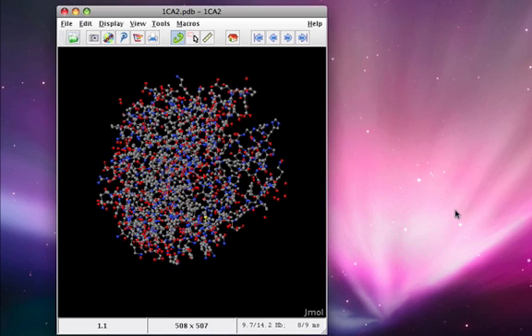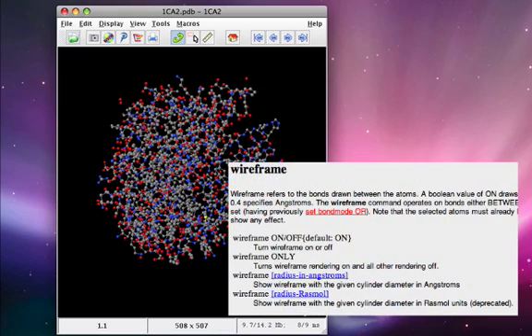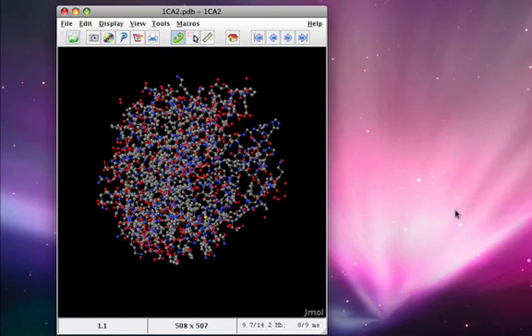Well, as you'll learn, there's a command in Jmol that strips away all of the bonds and atoms and leaves a very simple cartoon view of the protein behind. We should probably start here, and then from here we can add the wireframe view for the actual residues that are in the active site. That way we can really think specifically about the chemistry of the bonds and atoms only in the active site, and in that way our Jmol will achieve its purpose.